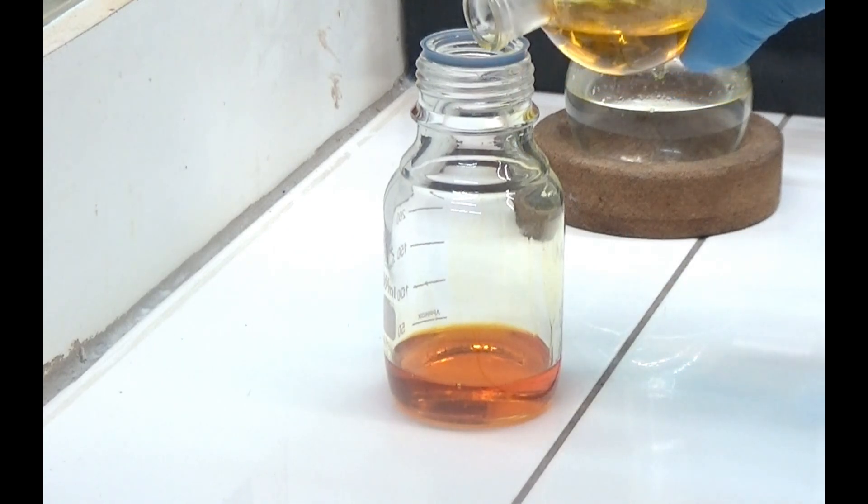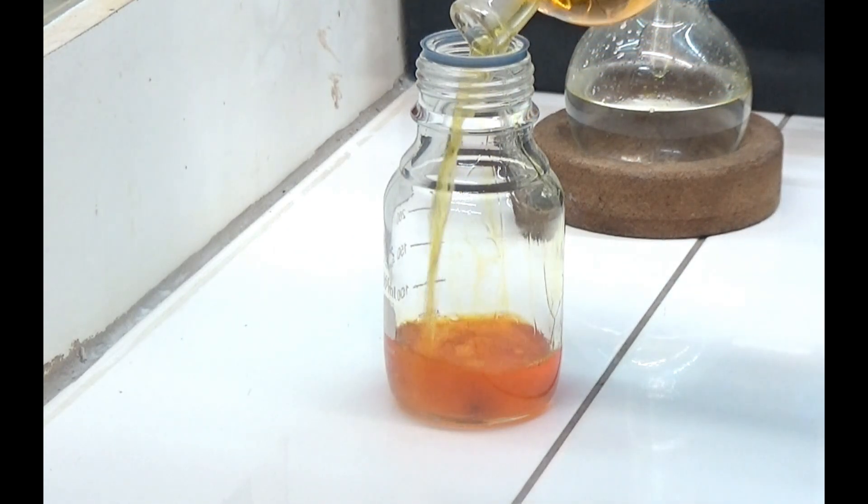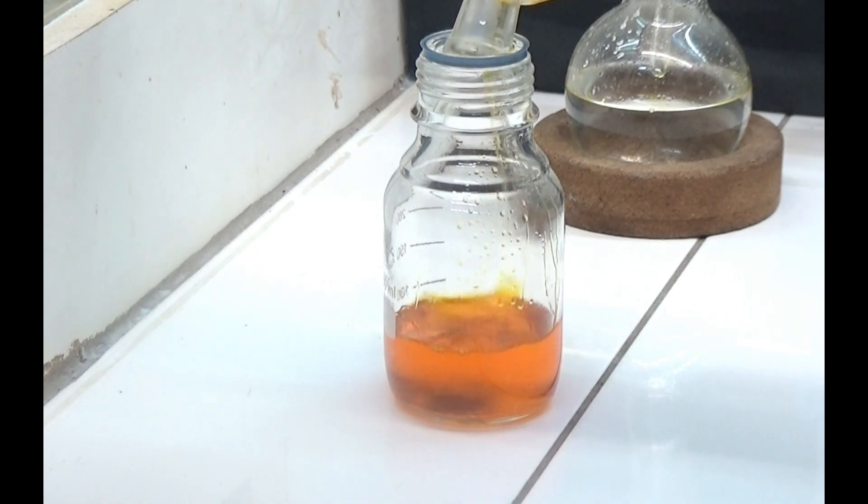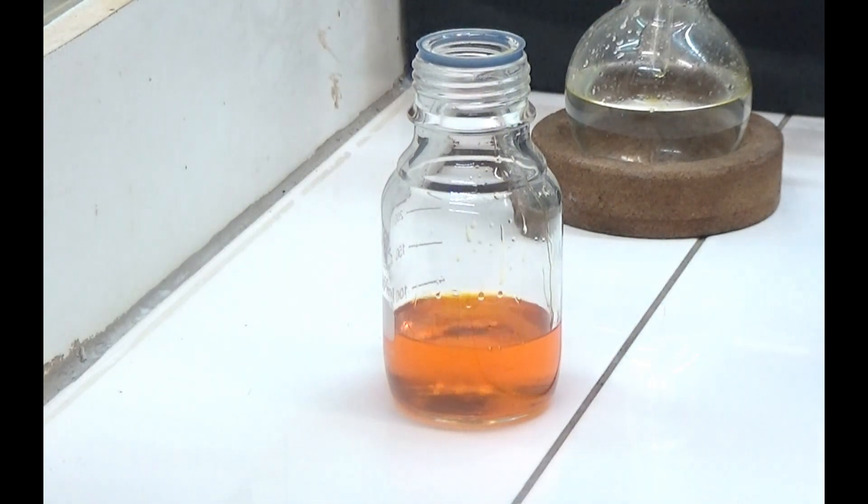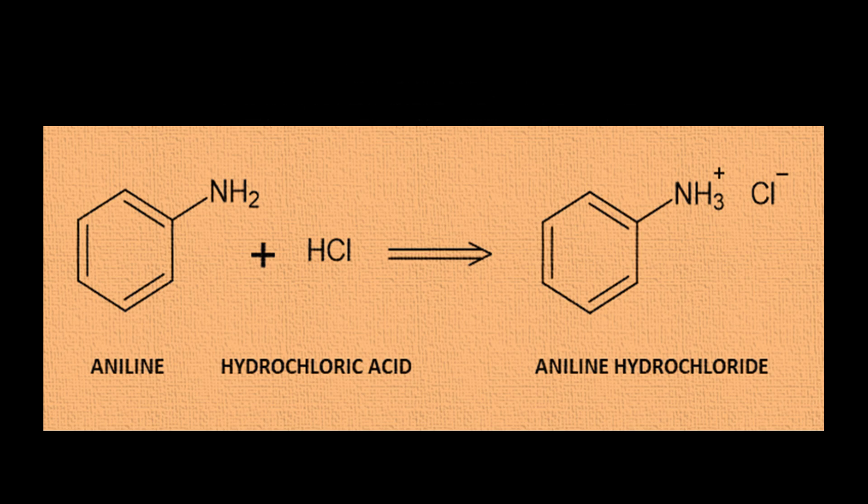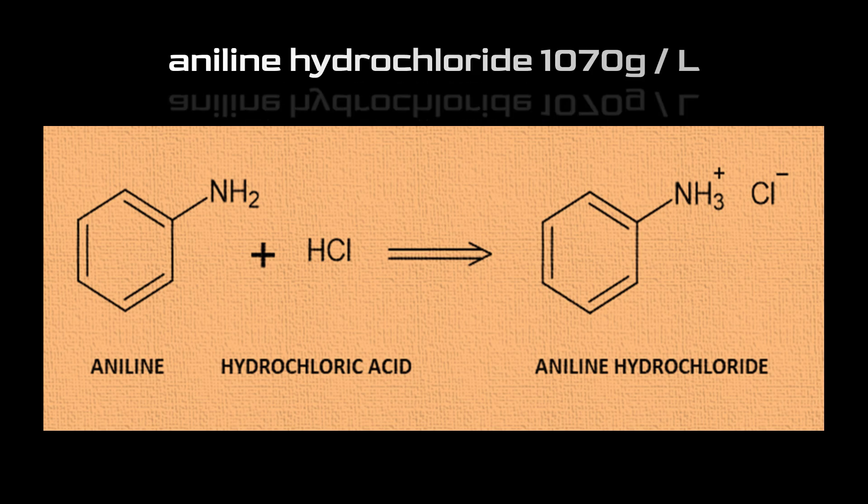Join the organic phases that contain aniline. To separate aniline from other secondary compounds, we will convert it into its hydrochloride with hydrochloric acid. Aniline has a solubility of 36 grams per liter. Aniline behaves like a base that upon contact with hydrochloric acid forms aniline hydrochloride, which has a solubility of 1070 grams per liter.